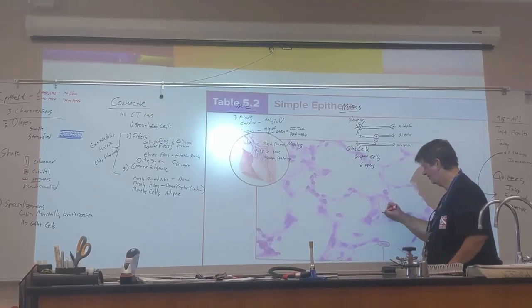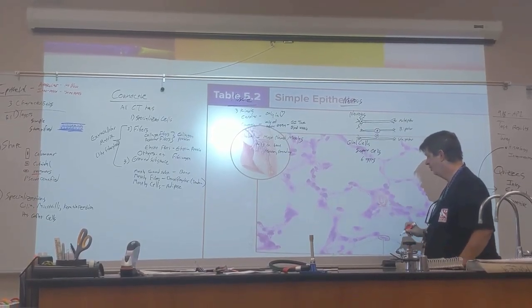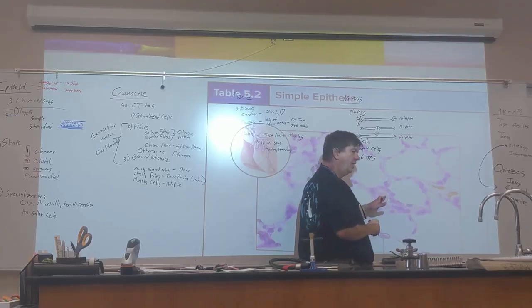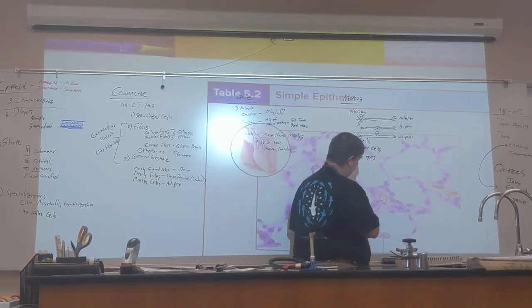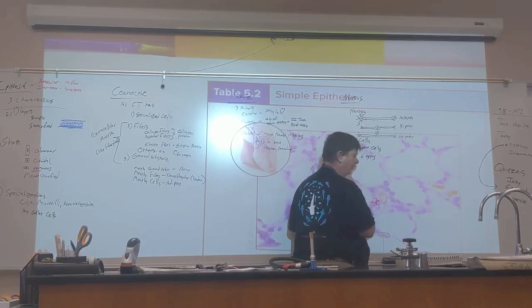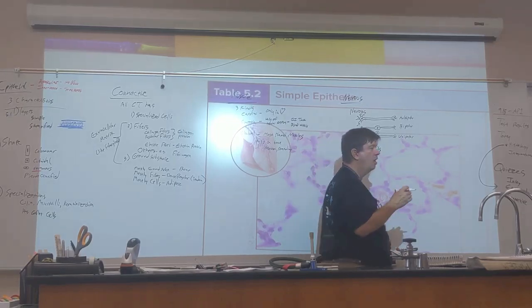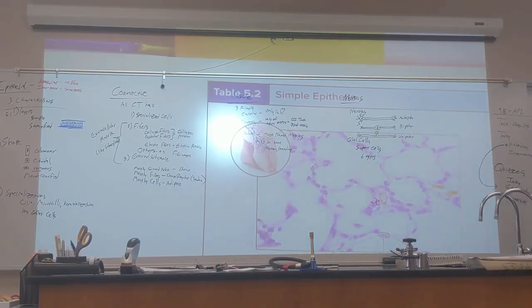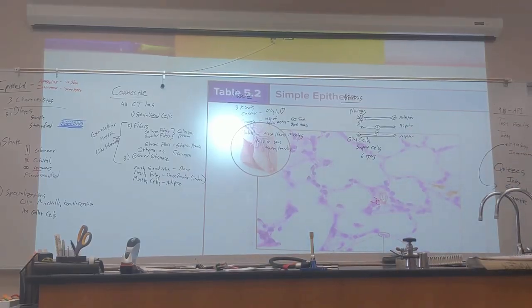That's a capillary. So the distance between this air sac and that blood is a little bigger. I can even outline it. You can see it right here. It's 2 cells thick. One simple squamous cell makes the wall of the capillary, and one makes the wall of the alveoli, the air sac of the lung. Does that make sense? Okay, so super flat.